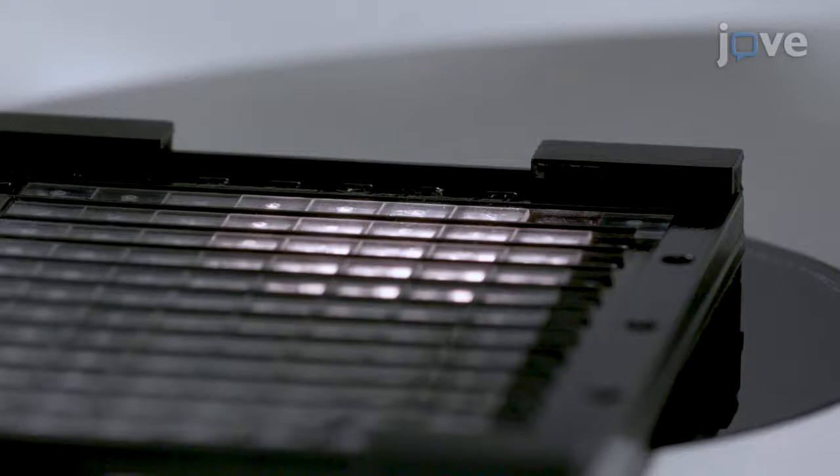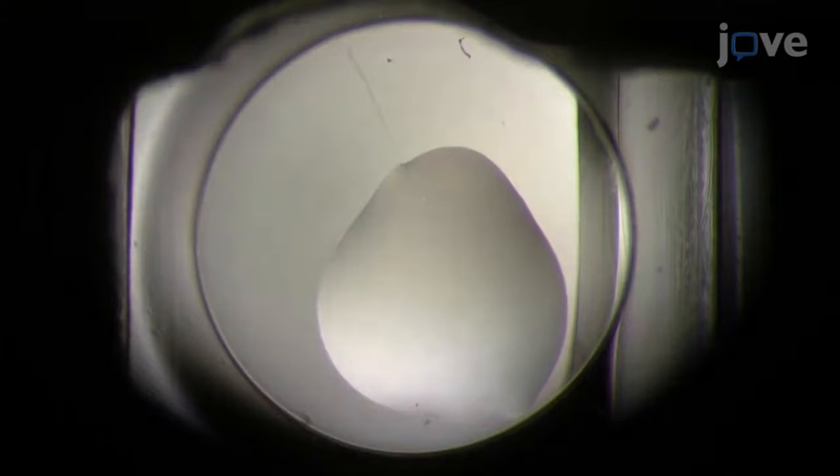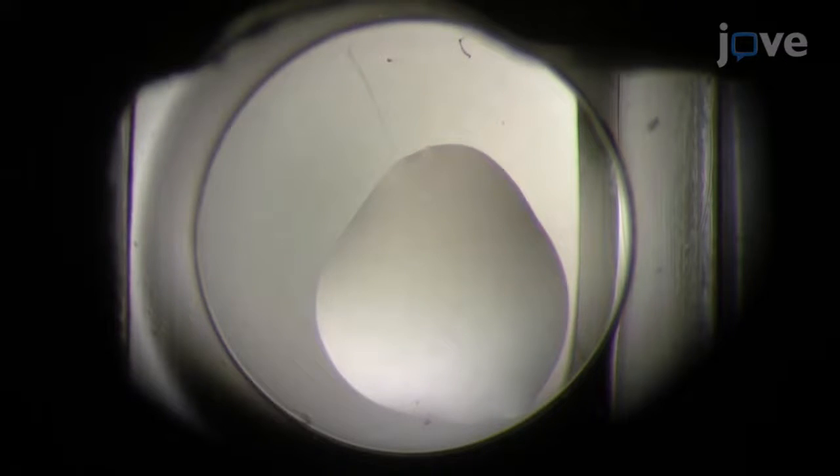Add 0.4 microliters of soaking solution from the reservoir to the fragment containing well using a fresh pipette tip. Ensure that the drop covers the dried-on fragment. Place the crystallization plate that contains the largest crystals.